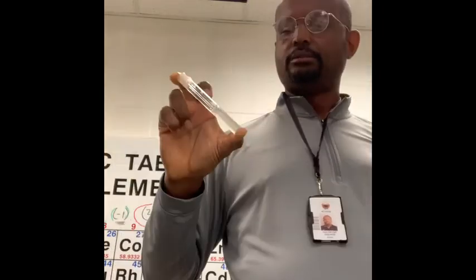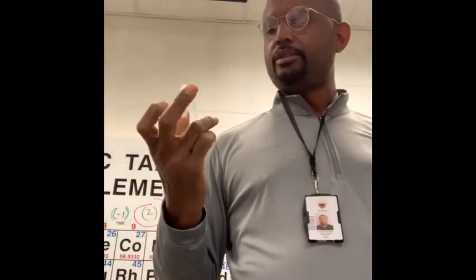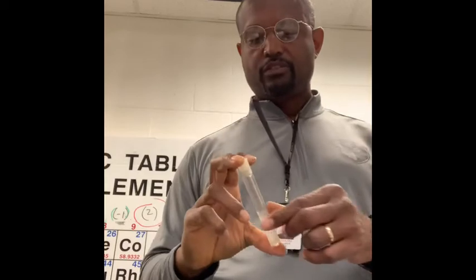Next is add 1 phosphorus test tablet, and here it is, my phosphate test tablet. It says cap the tube and mix until the tablets have disintegrated. So we're going to do the same thing here. We'll mix. Then we're going to wait for about 5 minutes.